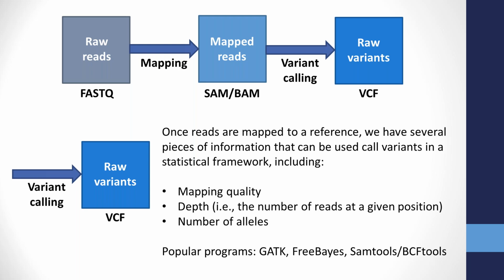And you might be familiar with popular programs for variant calling. So the Genome Analysis Toolkit, GATK out of the Broad, FreeBayes, SAMtools, BCFtools, there are a number of these.